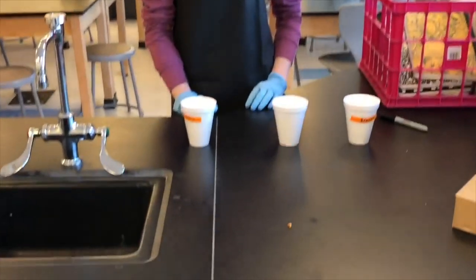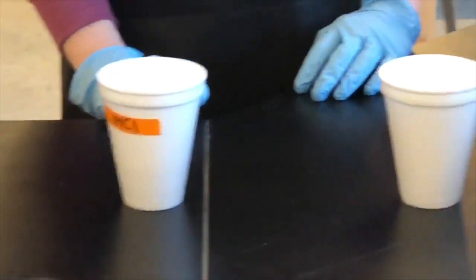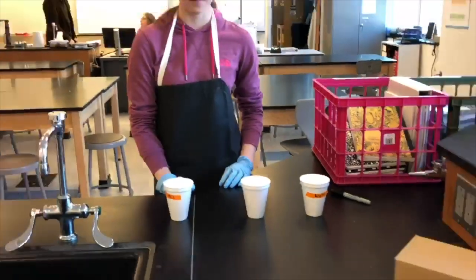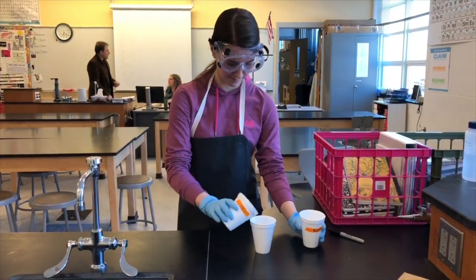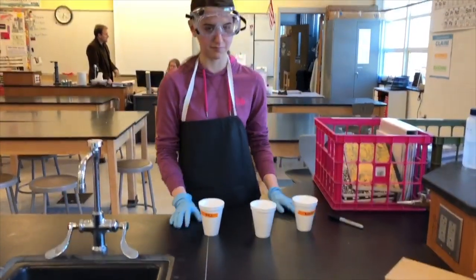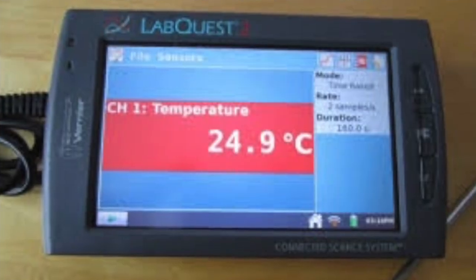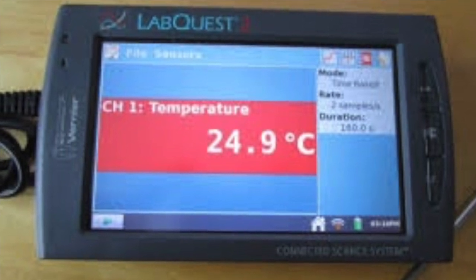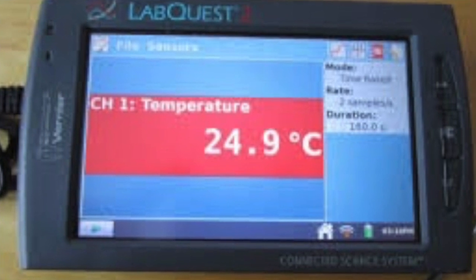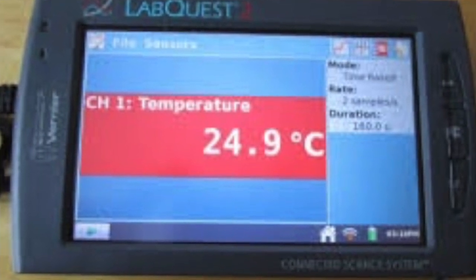The calorimeter in this lab was composed of a styrofoam cup and temperature probe. The cup holds the sample and allows for minimal heat loss because its foam contains billions of air bubbles and acts as a good insulator. It is also placed in a beaker for sturdiness. The temperature probe measures the temperature of the substance through the LabQuest, so the initial and final temperatures can be compared. To quicken the reaction of the substances, the mixture is stirred.